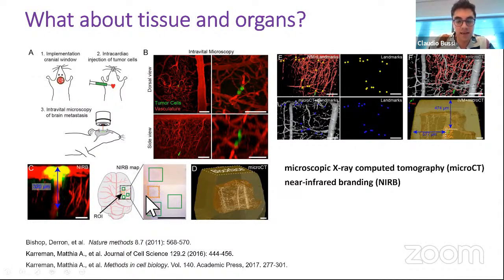Esta área naranja, o la que tiene el rectángulo naranja, es el área de interés, que ellos estuvieron haciendo el imaging, y a su vez hacen otras áreas, que son las que están acá con rectángulos verdes, como para tener coordenadas adicionales. Todo esto va a quedar más claro cuando les muestre un video del paso por paso, pero bueno, pueden ver cómo ya se va complejizando todo lo referido al equipamiento cuando uno quiere responder este tipo de preguntas.